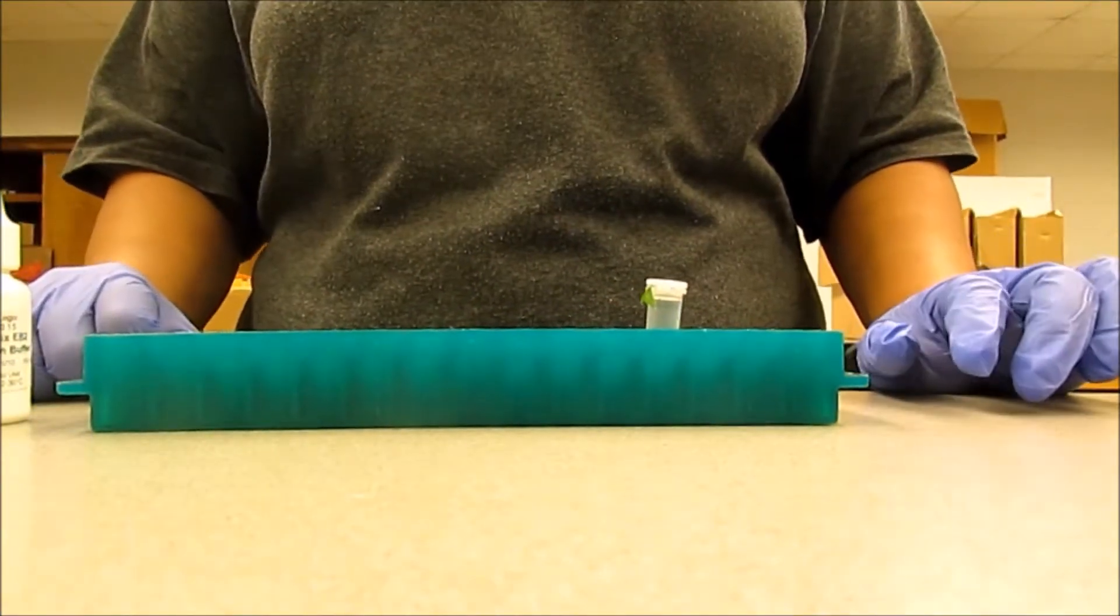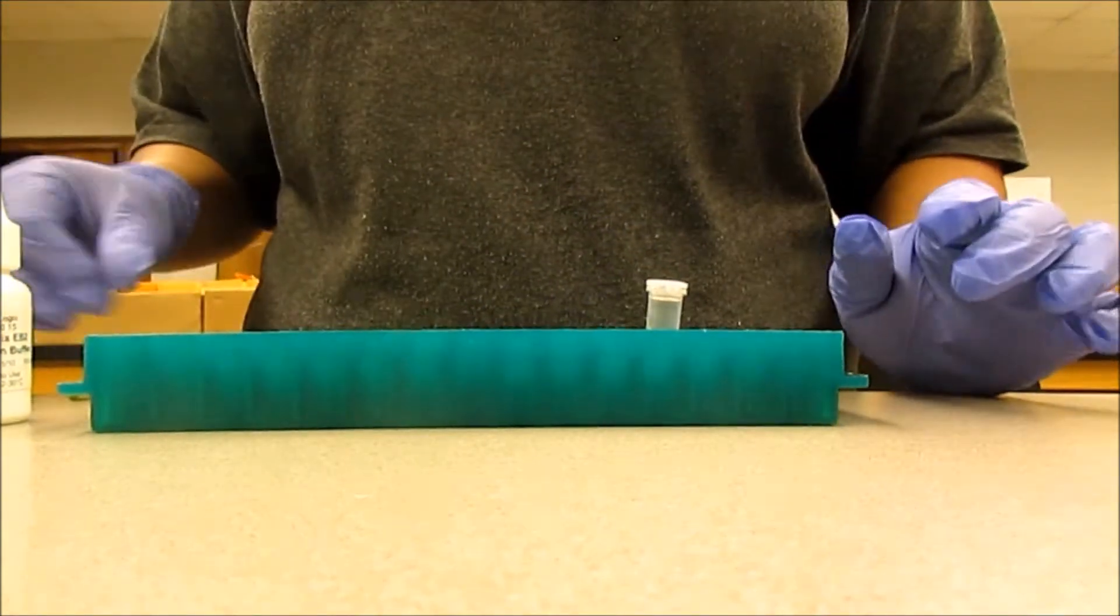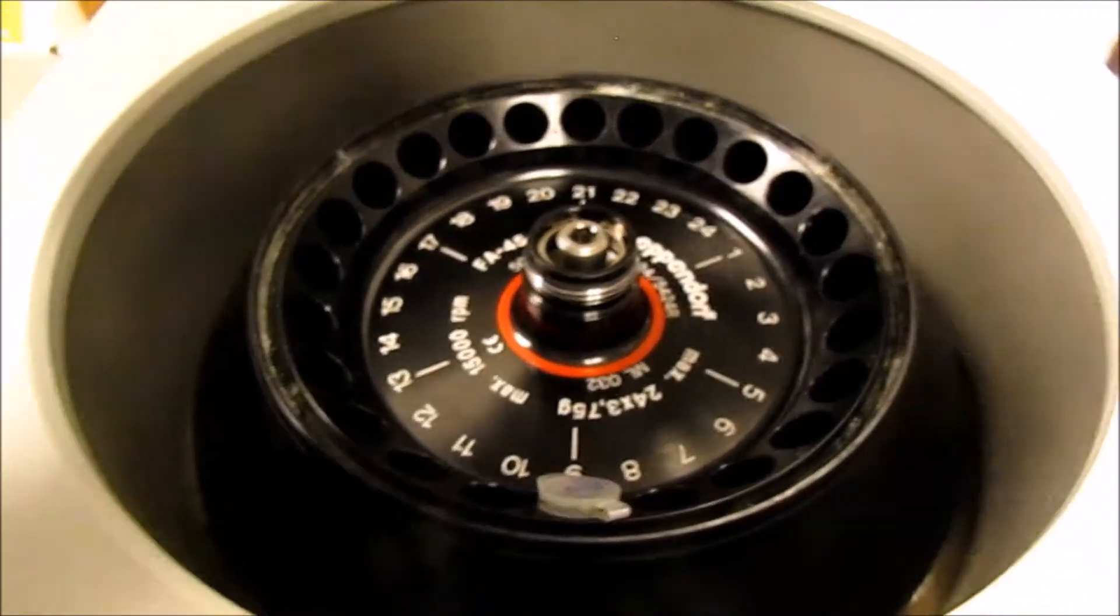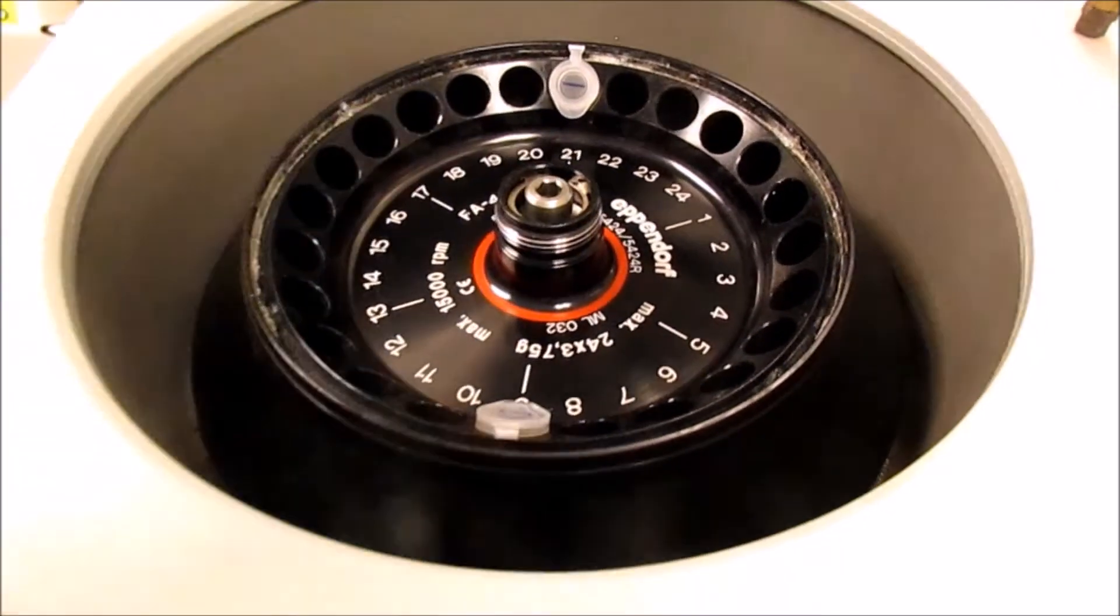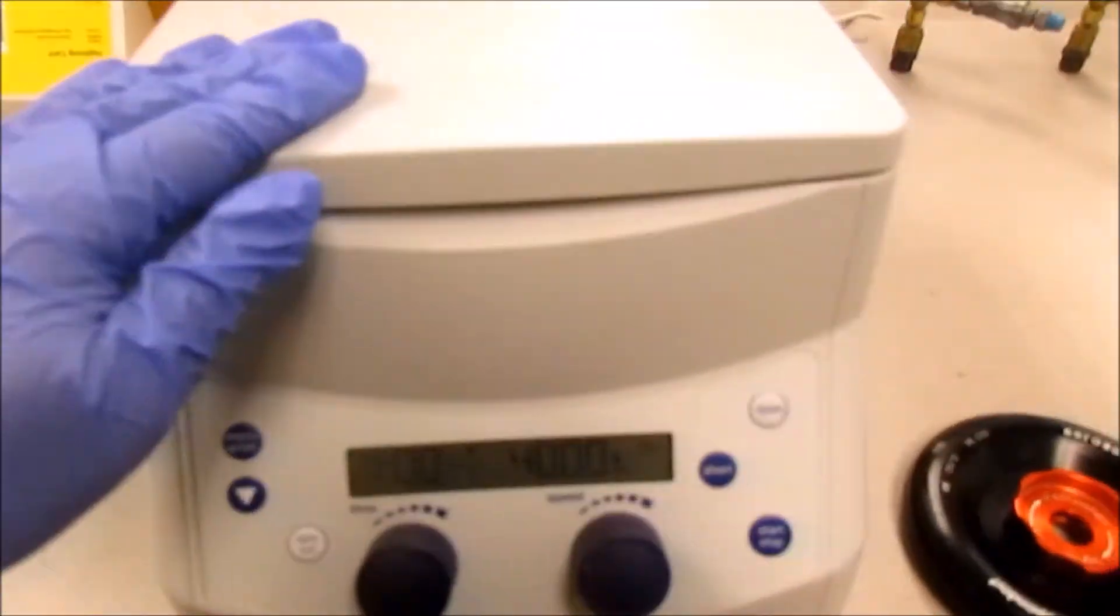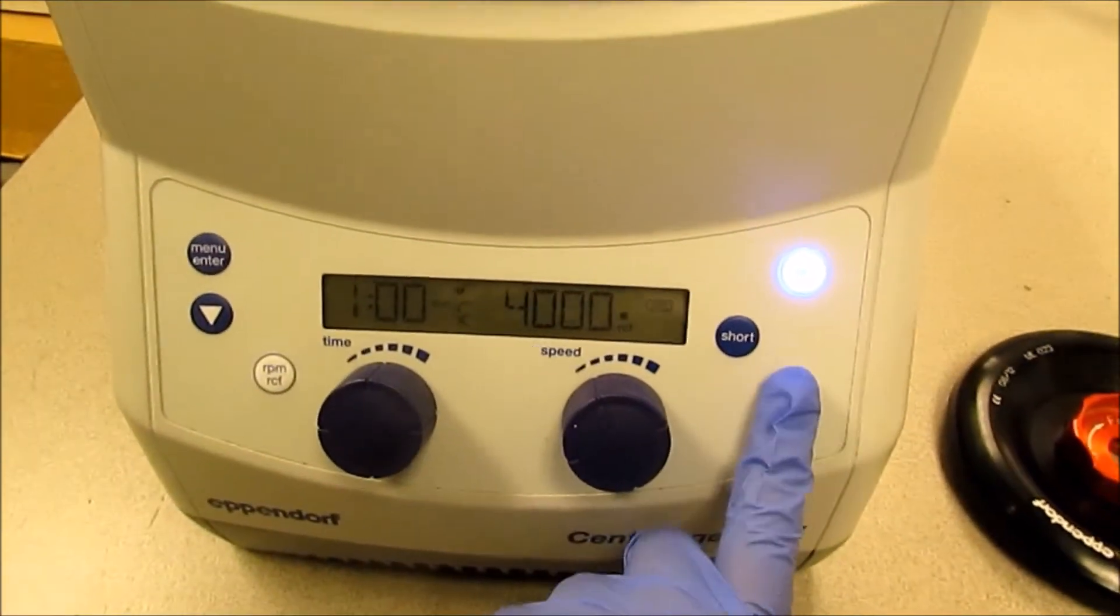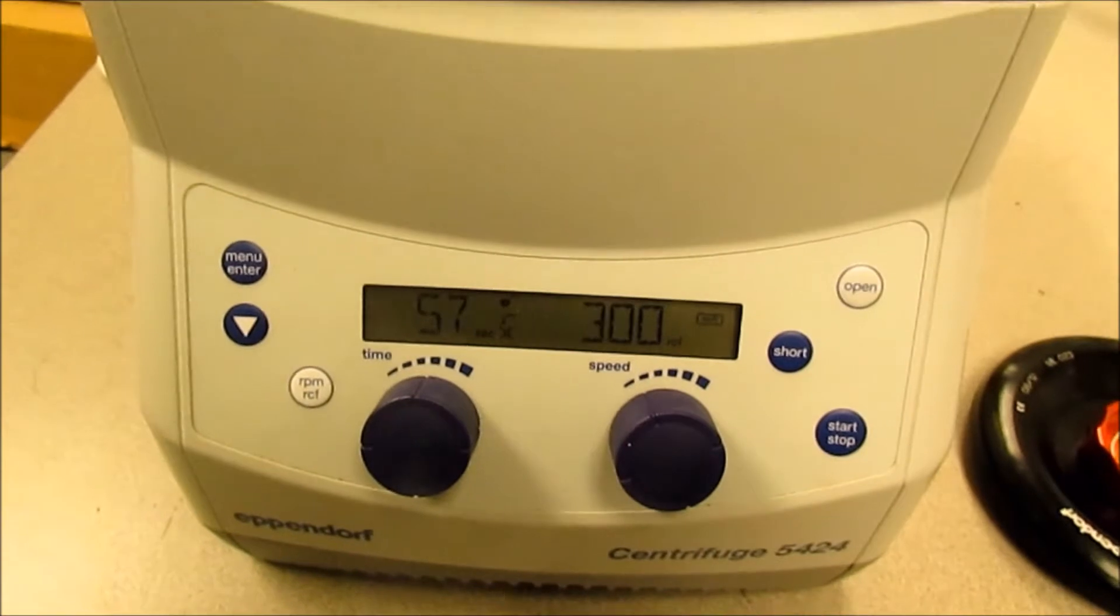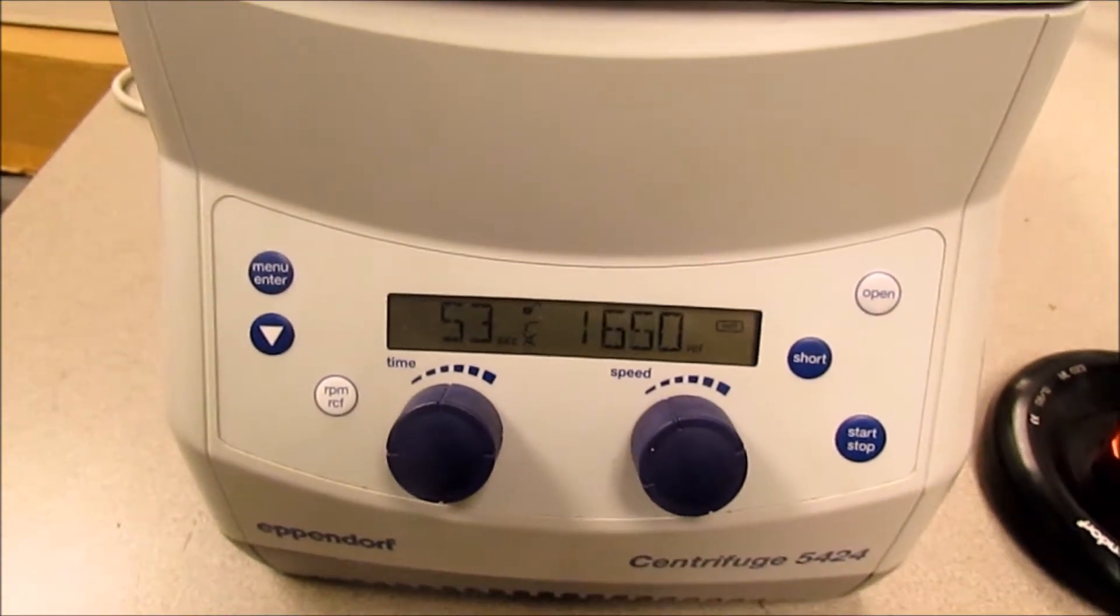After grinding the sample, we let it rest for 30 seconds, after which we centrifuge the samples. We just have to centrifuge for about 1 minute at 4000 RPM.